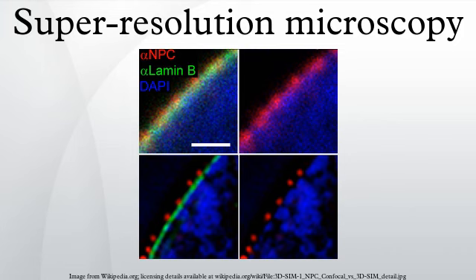4Pi. A 4Pi microscope is a laser scanning fluorescence microscope with an improved axial resolution. The typical value of 500 to 700 nanometers can be improved to 100 to 150 nanometers, which corresponds to an almost spherical focal spot with 5 to 7 times less volume than that of standard confocal microscopy.